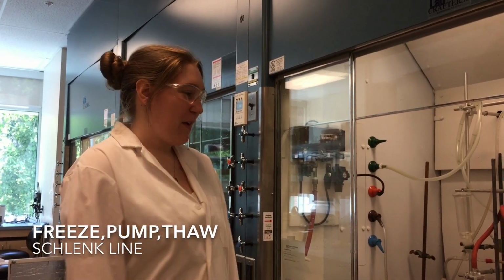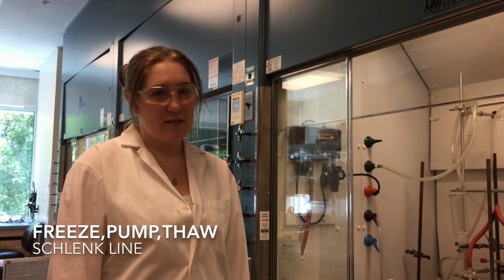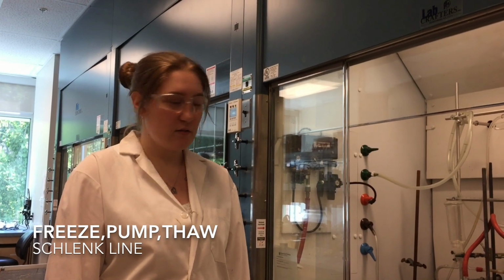I will be showing you the method of freeze pump thaw. It's a common method used for the degassing of solvents, so removing oxygen as well as any other volatile gases that are dissolved in the solution.